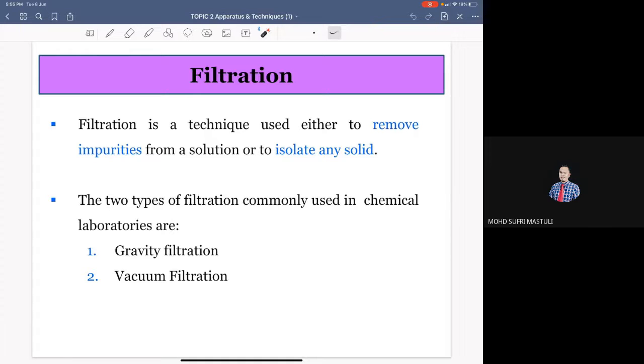We will continue our online lecture on topic 2 on apparatus and technique. This video will be the last subtopic for this topic 2. We will discuss filtration and titration. First, we will discuss filtration.